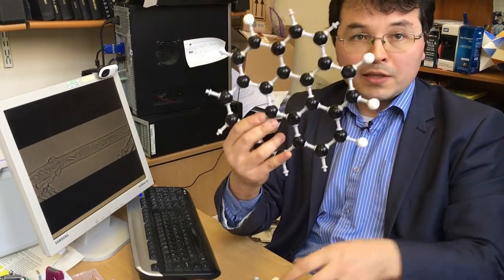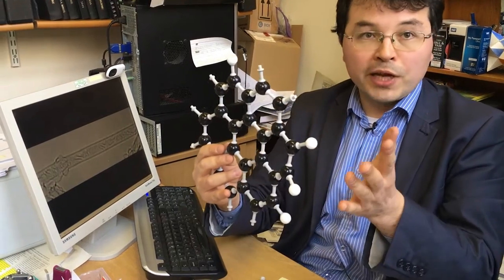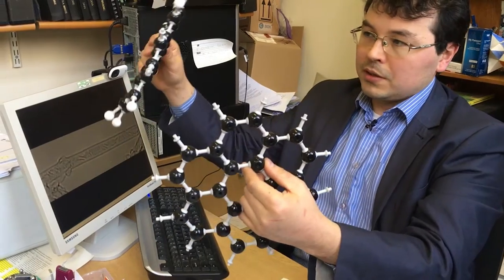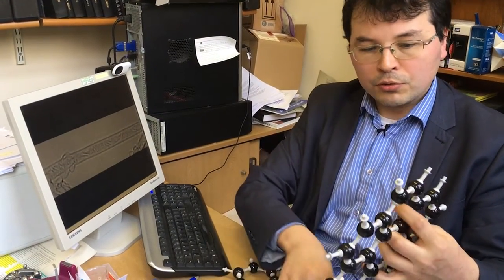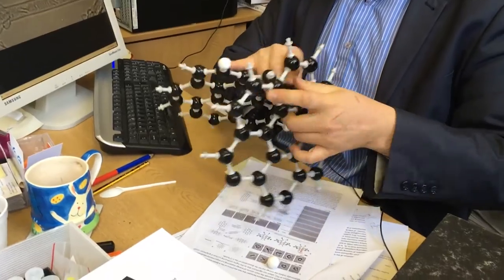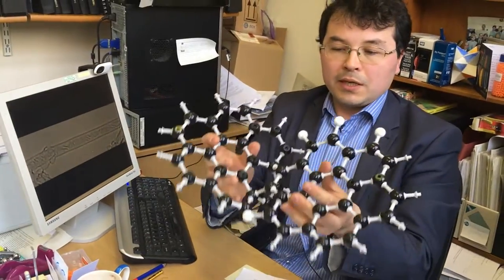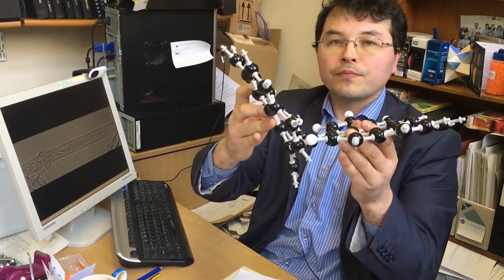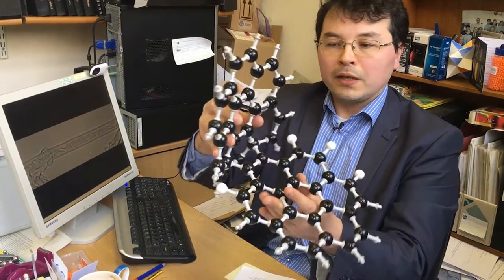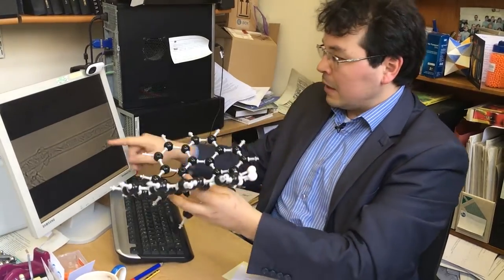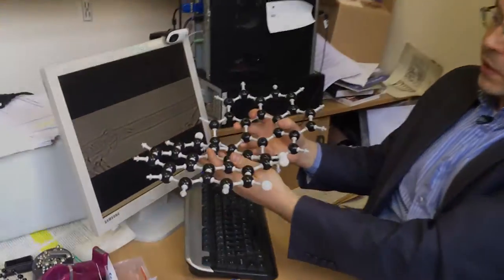Obviously this molecule has a neighbor and is going to react with a neighbor inside the carbon nanotube. This is the first molecule. They undergo a reaction of Diels-Alder cycloaddition, which is essentially addition of one molecule to another. We form this elongated structure, which is also not linear anymore. It's not a pancake. It's two pancakes forming this sort of clamshell structure. And it's exactly what we're seeing here. We see longer structures on the screen. They're not linear anymore.